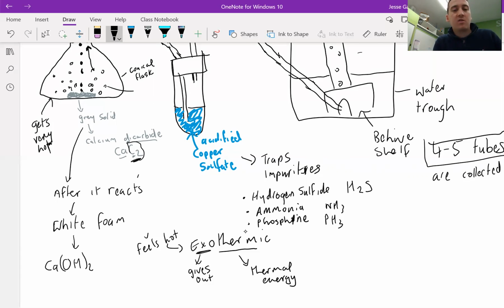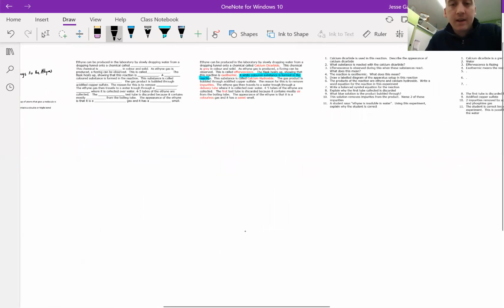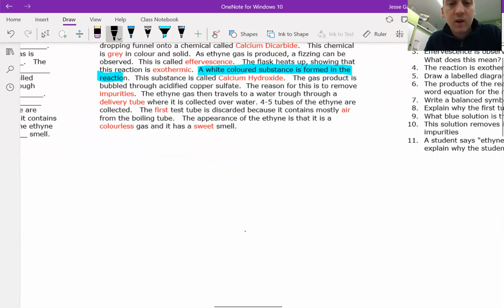So the carbon was attached to the calcium before. Some of the OHs from the H2O are displacing the carbon. Okay, so the carbon is getting displaced, and then we are forming calcium hydroxide, which is the name of this chemical. So, calcium hydroxide. Apologies, I did not explain that properly the first time.